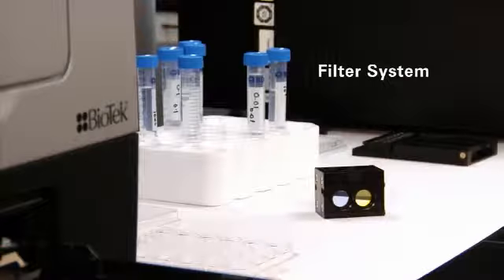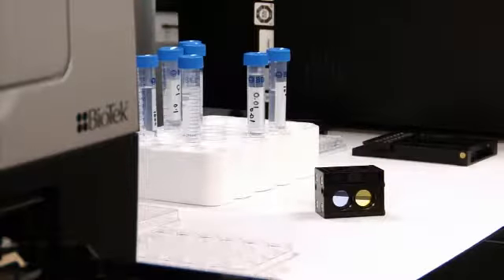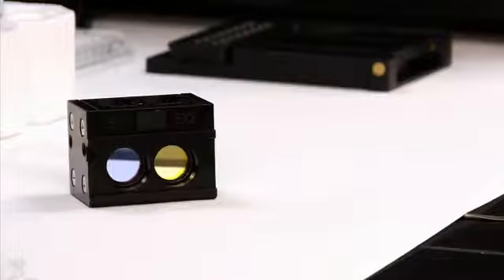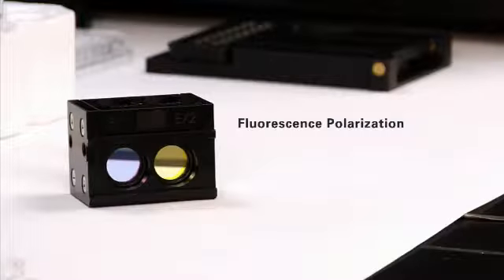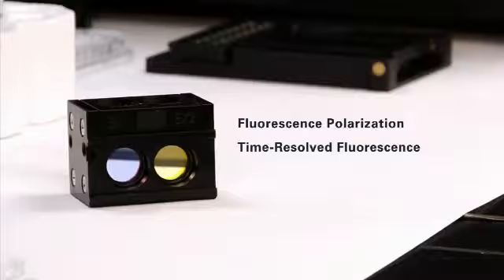The filter system is available as a separate module and can be added as an upgrade. This module supports advanced read modes such as fluorescence polarization, time-resolved fluorescence and TR fret, and turns the Synergy H1 into an advanced hybrid microplate reader.